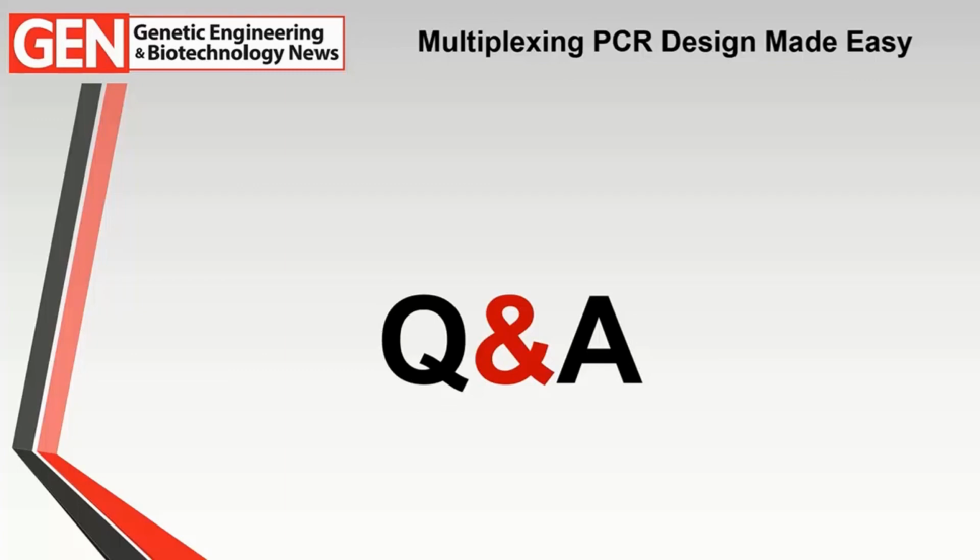So we're doing a massive, massive calculation. These are not something you could run on a laptop computer. So that's one of the advantages of using our cloud-based computing. It depends on the size, and that was a large panel there. Sometimes they don't scale as much as you might think. Some of the larger panels in Arjang's talk had 7,000 to 10,000 sequences in their inclusivity and exclusivity. Those, we munch right through.